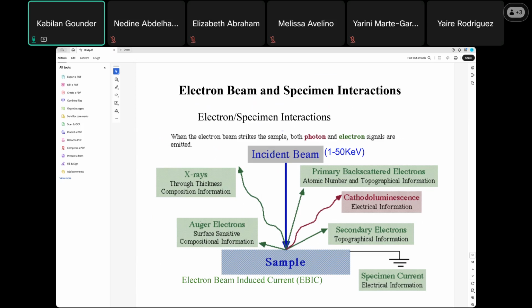So based on this, this illustration shows that not only are you seeing the structure of any sample, but you can also get more information on different elements, based on what kind of signals you are getting and identifying.